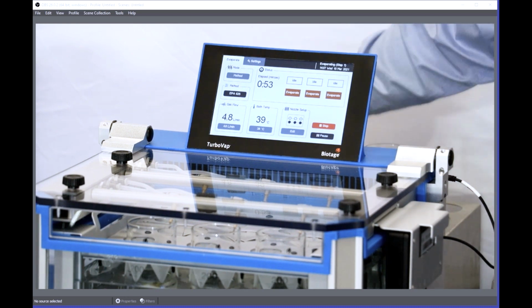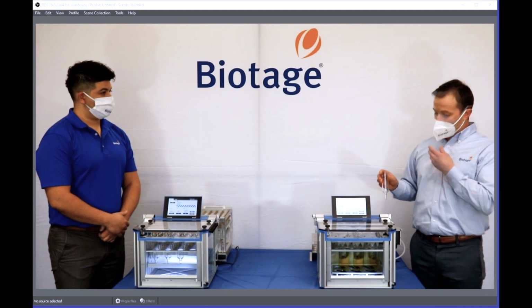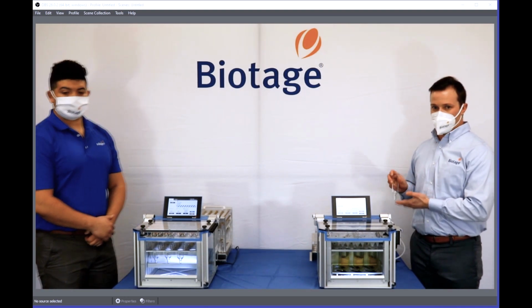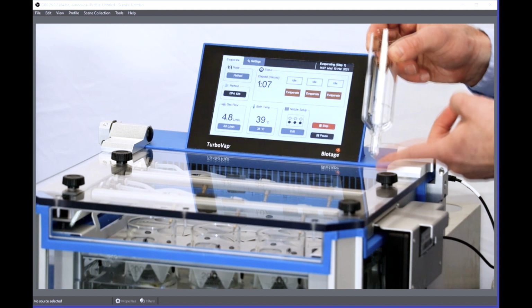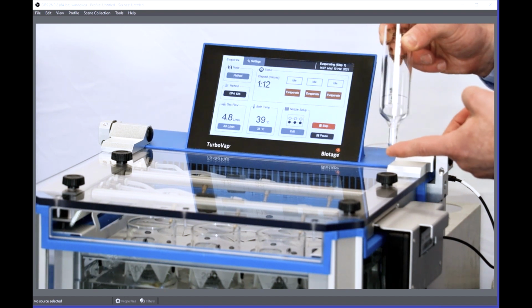One other thing I'd like to add with the TurboVap 2, as I mentioned, we have 50 mil tubes. And Sarah, I'll let you zoom in. They might have a better picture of it. So as you can see, we have 50 mil tubes as well. This also has a 1 mil tip on it.